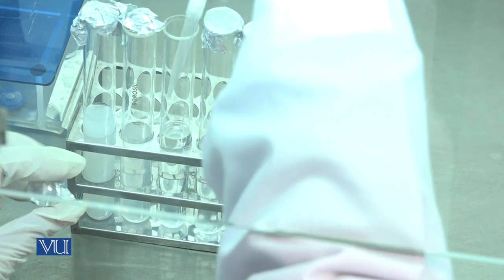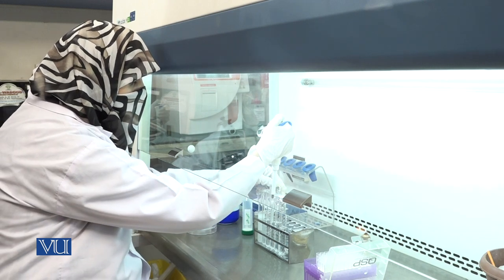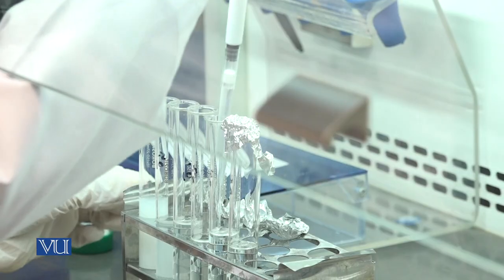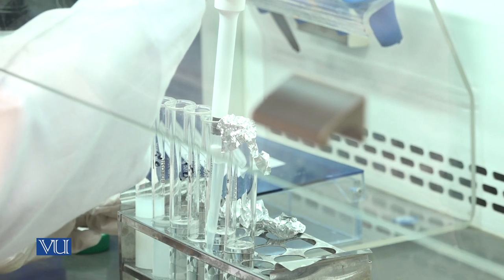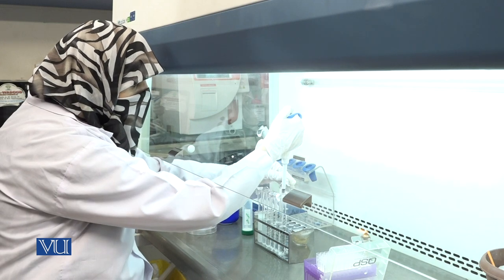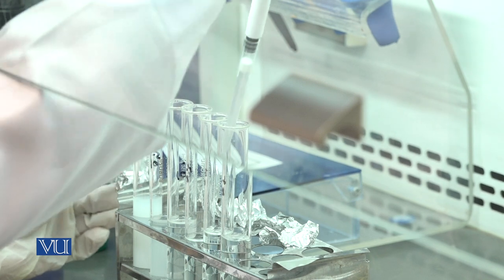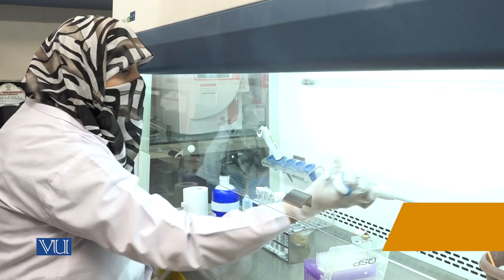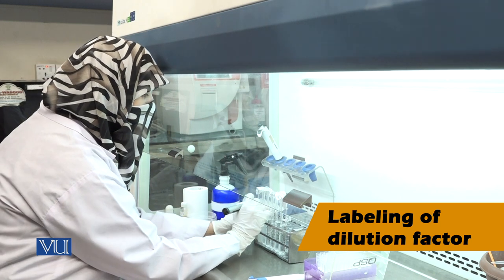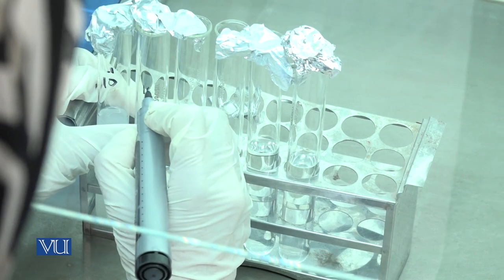Similarly, the same procedure should be used for all 6 test tubes. Continue adding from each test tube to the next and properly mix the solution each time. After addition of solution, label each test tube with its dilution factor. The first test tube is a 10 to the minus 1 dilution.